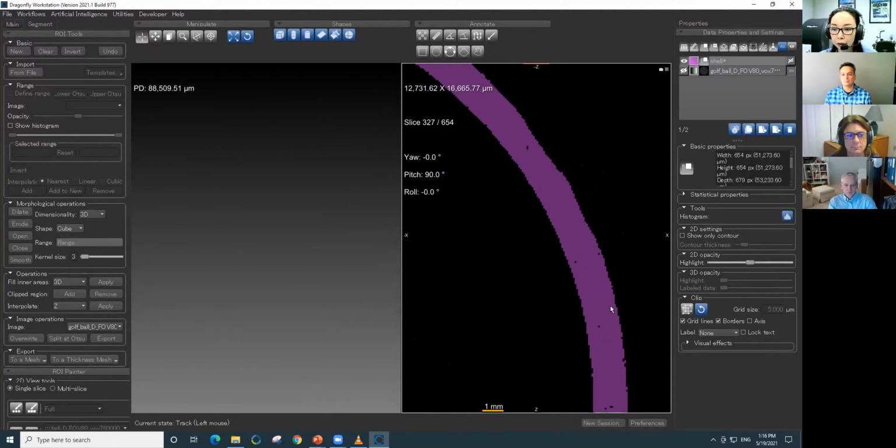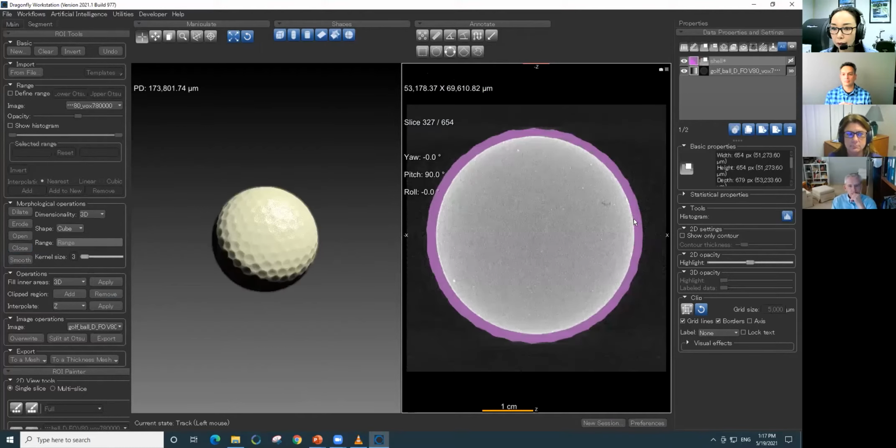When you zoom in, you realize that there are a couple of holes inside of the shell. And this is not going to be good when you want to do thickness distribution analysis. So I'm going to clean this up or close the holes by literally clicking this close button. This is a morphological operation, and by doing this you can close most of the small holes. I'm going to click this, and they're gone. So it's a pretty clean segmentation we have.